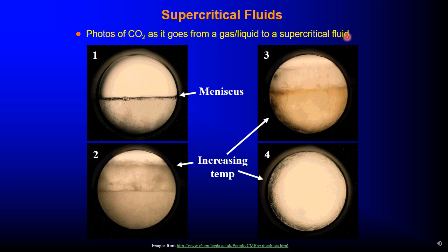You can see one where you can still see the meniscus, and then as you increase temperature, you can see what is happening. Then increasing the temperature more, now it is not turning into gas, so it is purely fluid.